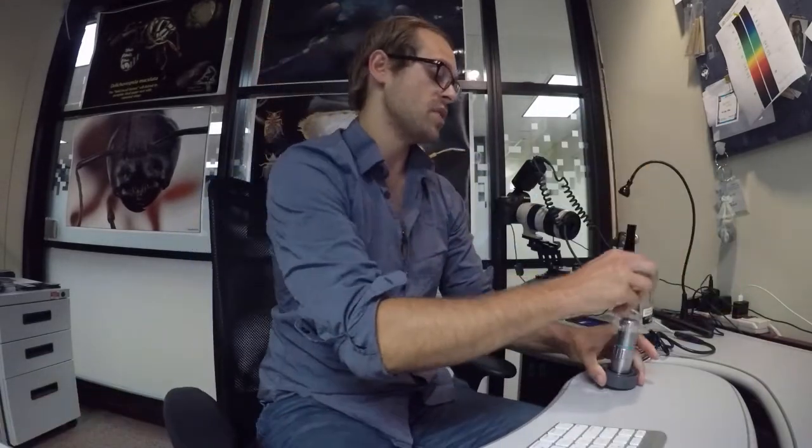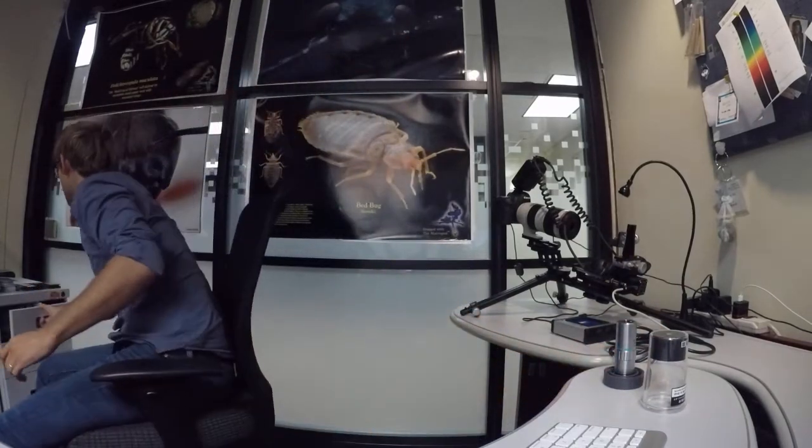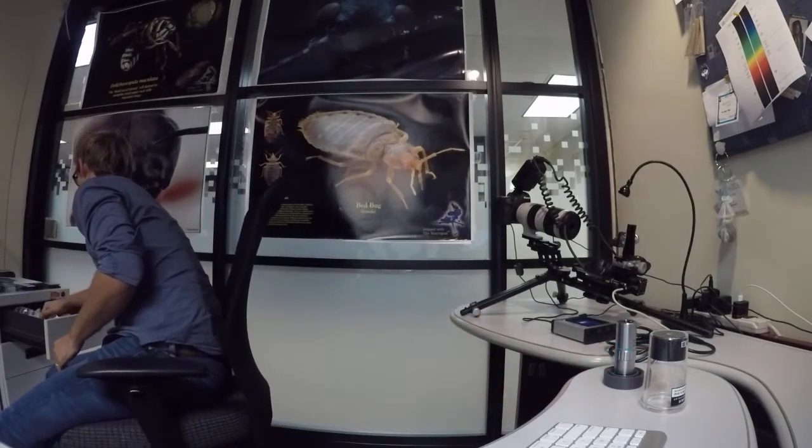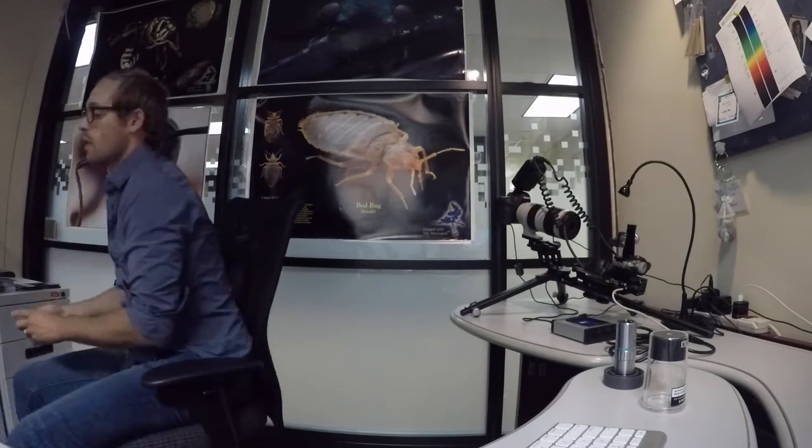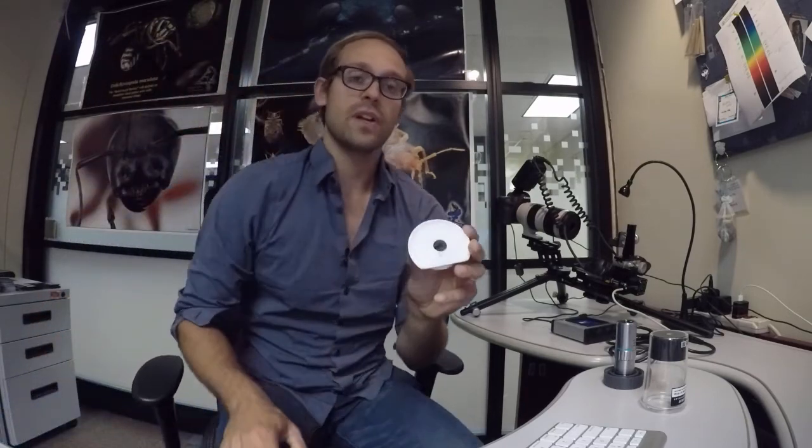We're going to tighten that back up, grab our 50x objective, then we're going to grab a diffuser that's specifically designed for that objective. And in that case, that's this one here.